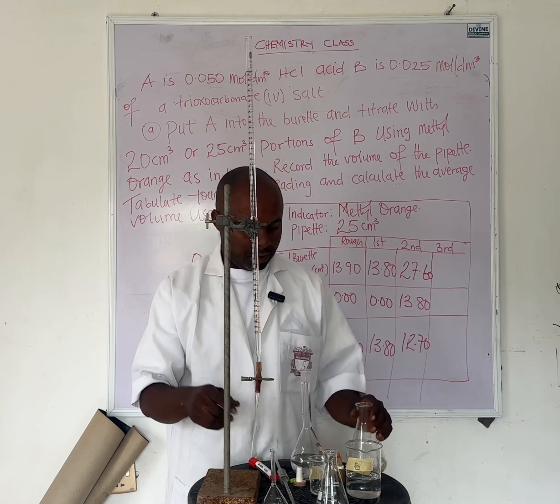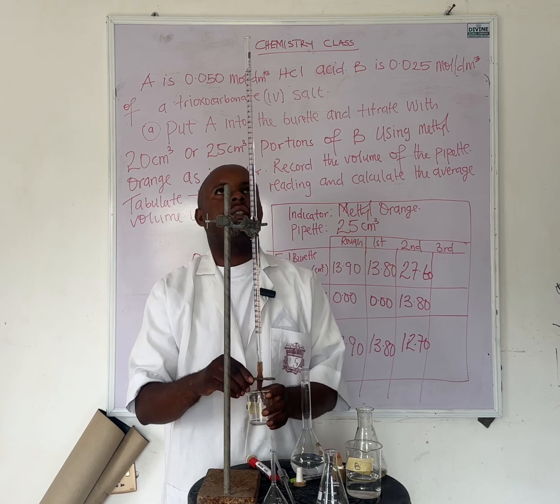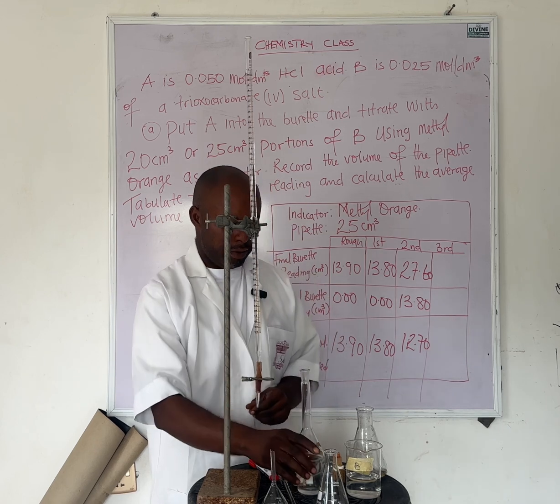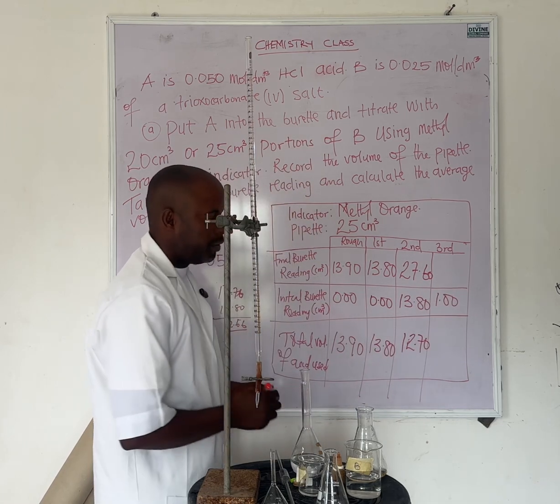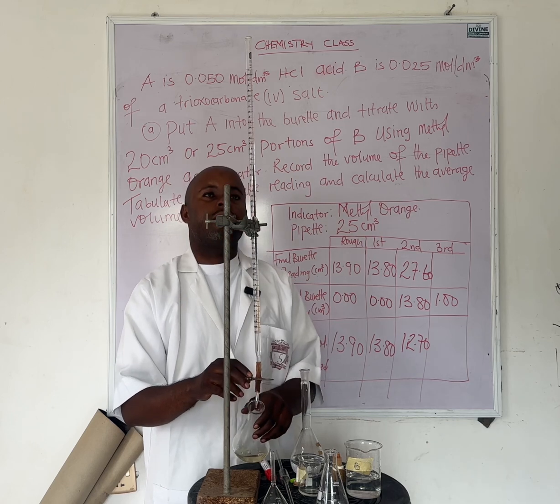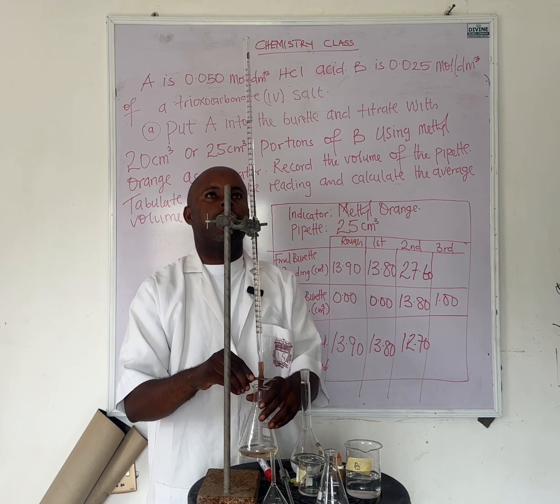And acid, let's remove this. Let's adjust to 1.0. All right. With the initial here, we are using 1.00. Started from 1.00. So we're going to titrate now. So we can release to 10.